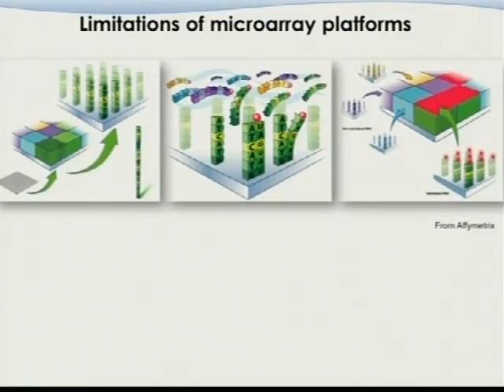So this is the basic principle of an Affymetrix array experiment. You can see that this is the microarray, which looks pretty big here, but actually it's the size of your thumb. It's very, very small. And this surface is divided into many different small compartments. Some of them have over a couple million compartments. So you can see that each part is very, very tiny.